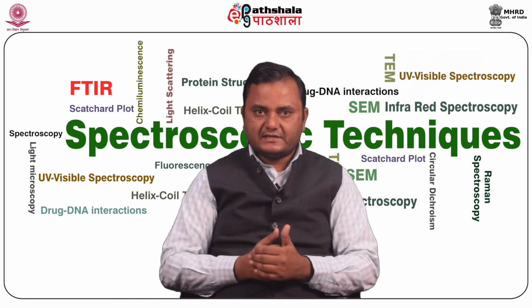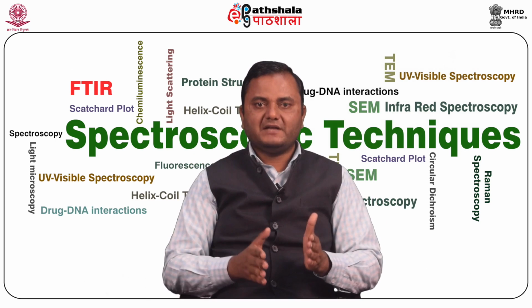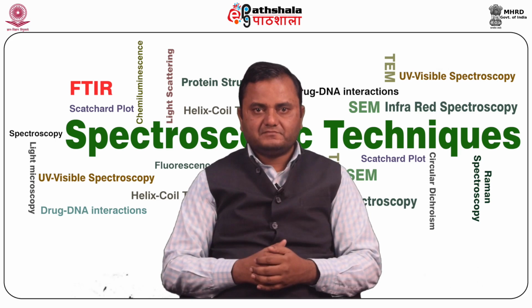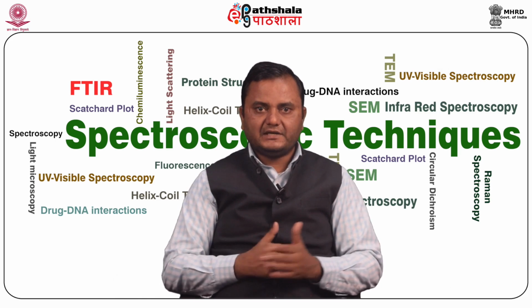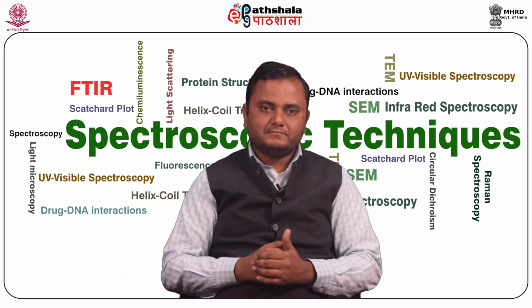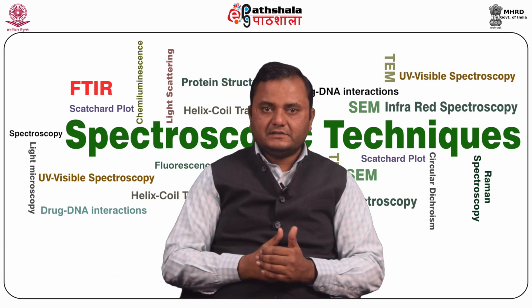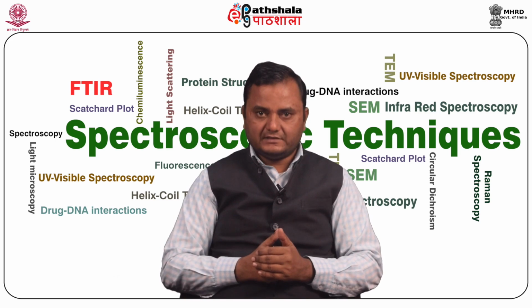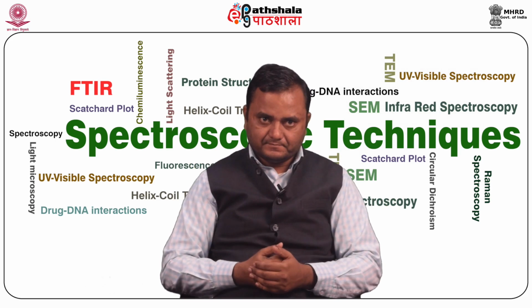And thus the FTIR spectrometer obtains an IR spectrum by first collecting an interferogram of a sample signal using an interferometer, then performs a Fourier transform on the interferogram to obtain the spectrum. An interferometer is an instrument that uses the technique of superimposing or interfering two or more waves to detect differences between them.